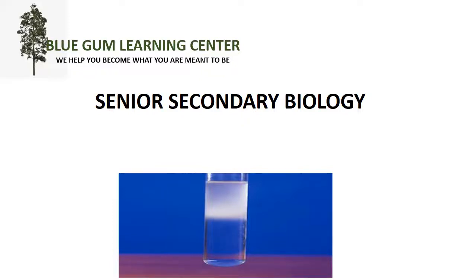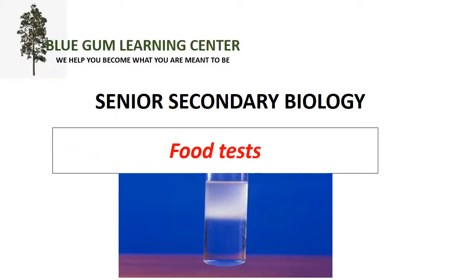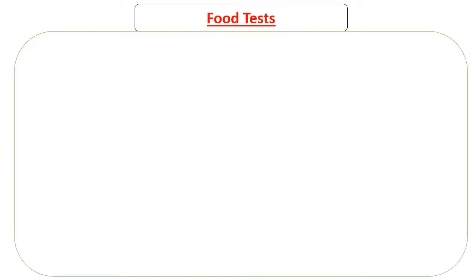Welcome to the last part of Introduction to Nutrition. In this video, we're going to take a look at food tests. This video is basically about a practical part of biology, and of course the question also comes in paper 1 in multiple choices.